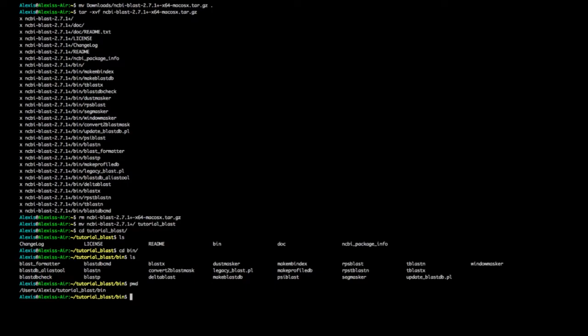If I want to run my BLAST command from elsewhere — not necessarily from inside tutorial_blast/bin — I can add the bin directory to my PATH. To do so, you just write your PATH export command and add it. If you're on Windows, PowerShell may offer a different option. On a bash shell, this should work. For other shell types, check your shell's equivalent.